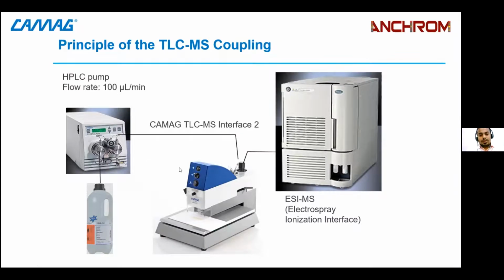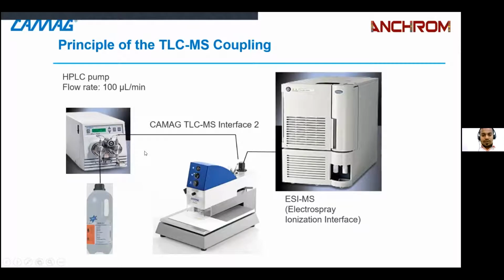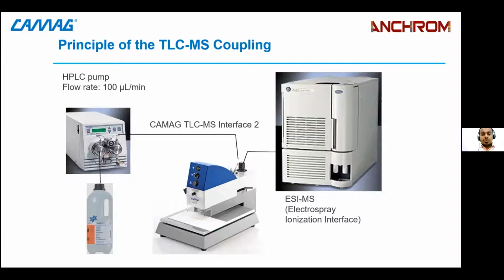The inlet of the interface will be connected to the HPLC. If you have HPLC, you can connect directly, or if you don't have, you need to have an HPLC pump. The pump will be connected to the inlet of the interface, and the outlet will be connected to the MS. Within a fraction of 10 to 20 seconds, the analyte from the stationary phase will be dissolved in the carrier solvent, and it will be carried through to the MS, and in between there is a frit which will prevent the silica gel from passing.